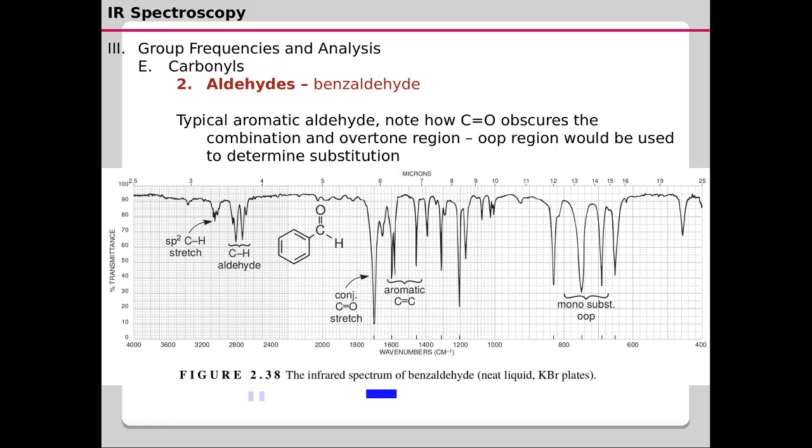Okay, and this is a monosubstituted phenyl ring, and if you remember the cases where we discussed monosubstituted mononuclear ring systems, then you can see that the out of plane bending vibration of the CH bonds above and below the plane of the phenyl ring usually happens between a range of 700 and 800 centimeter inverse. So these bands are signature bands for a monosubstituted phenyl ring system.